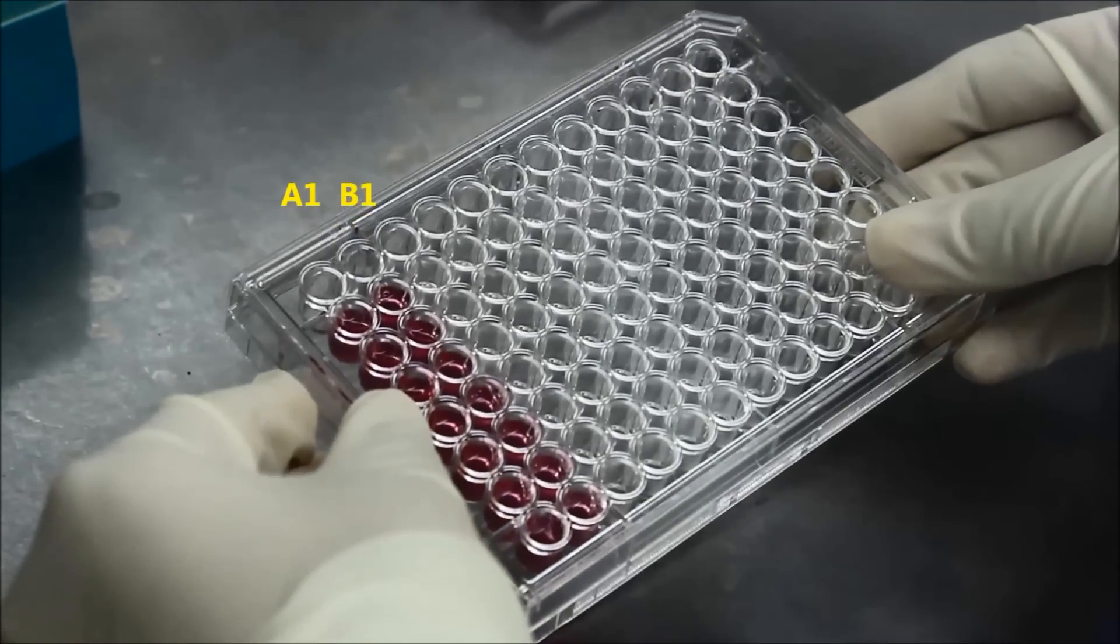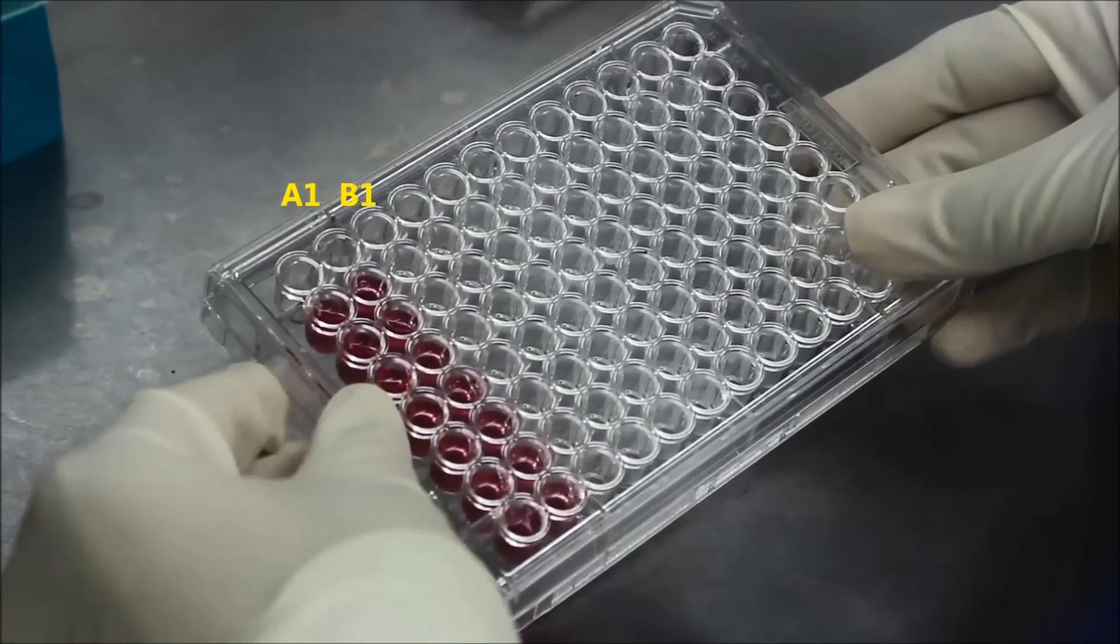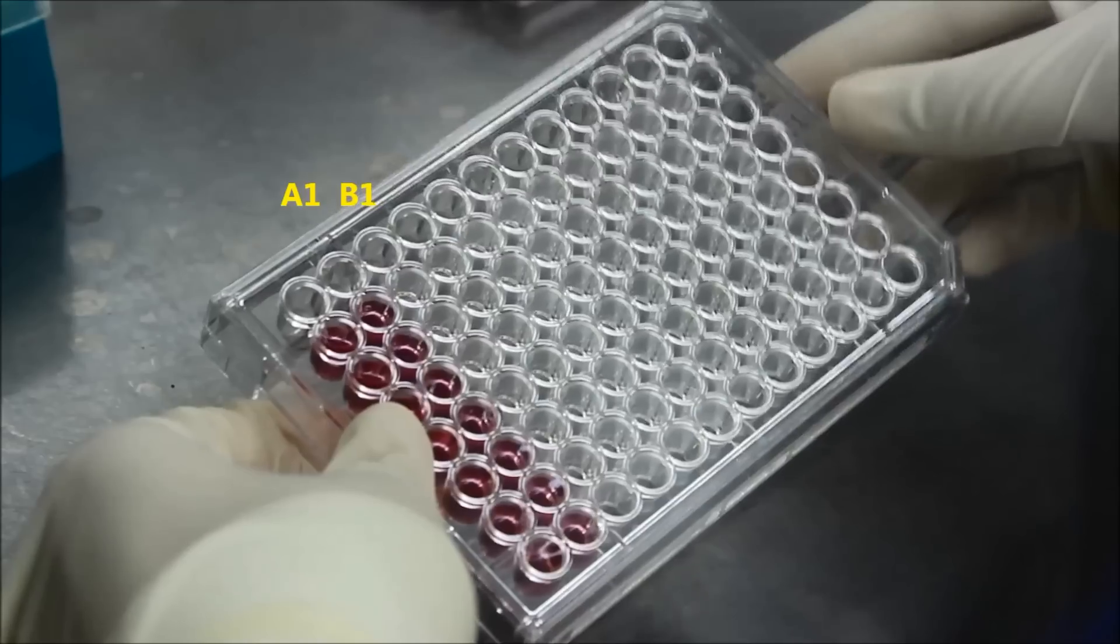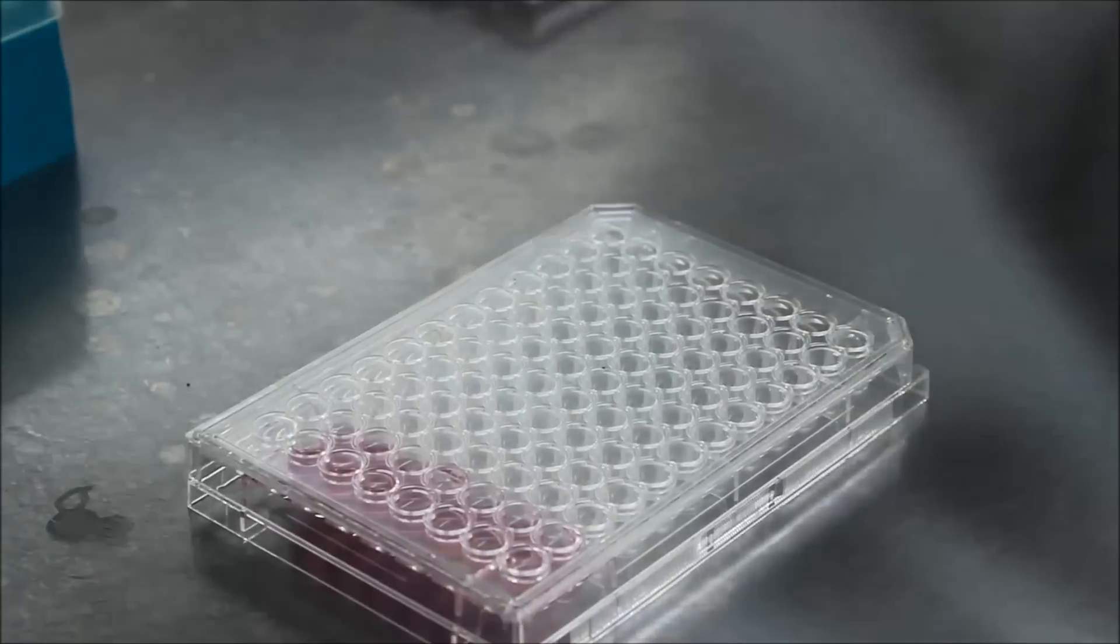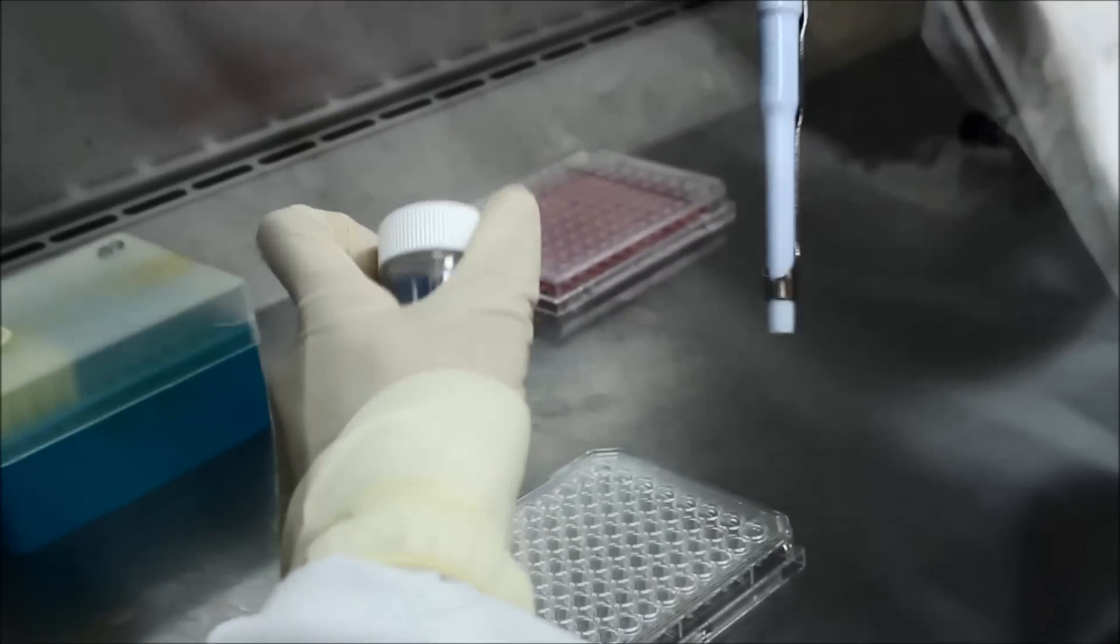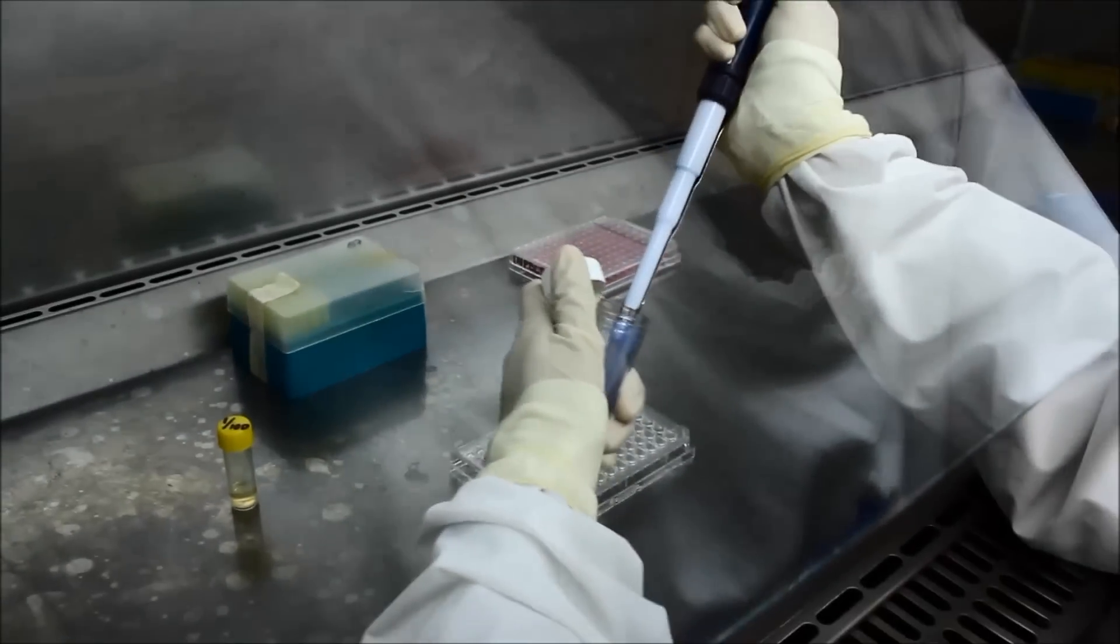After adding 270 µL of growth media to the first two columns, except for wells A1 and B1, add 300 µL of your diluted virus stock to these two empty wells.